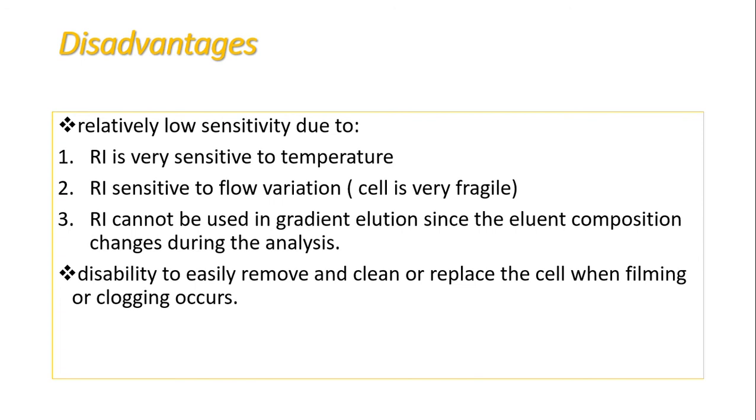The most common disadvantage of RI is that it can't be used with gradient elution, and this is the universal disadvantage, because the eluent composition changes during the analysis.